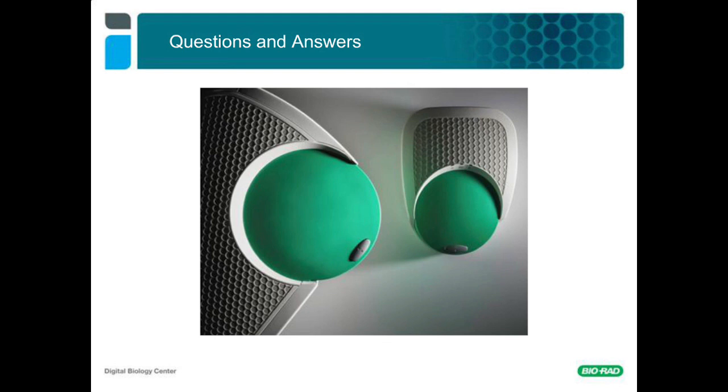So that's a great question. We do have a limit of about 1 microgram per 20 microliter reaction that we recommend, and that is due to viscosity considerations. However, digesting your DNA with 1 and sometimes even 2 enzymes can actually help with that viscosity and cause the DNA to be added, not to cause any problems at these higher concentrations. However, we do recommend that you stay at or below 1 microgram of DNA per 20 microliter reaction.